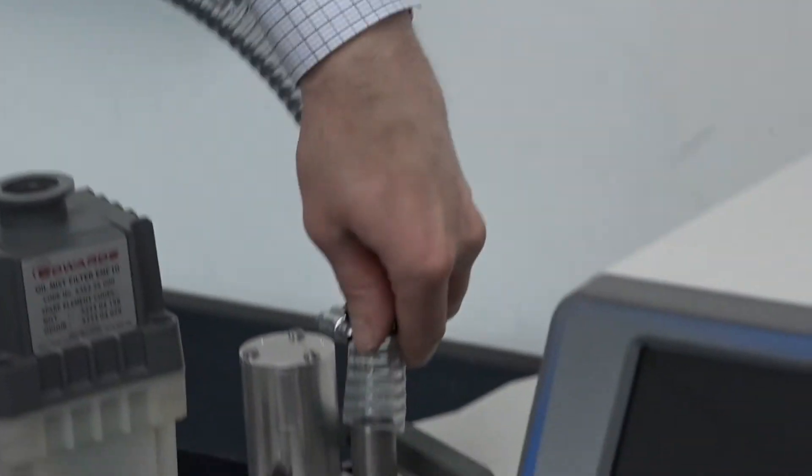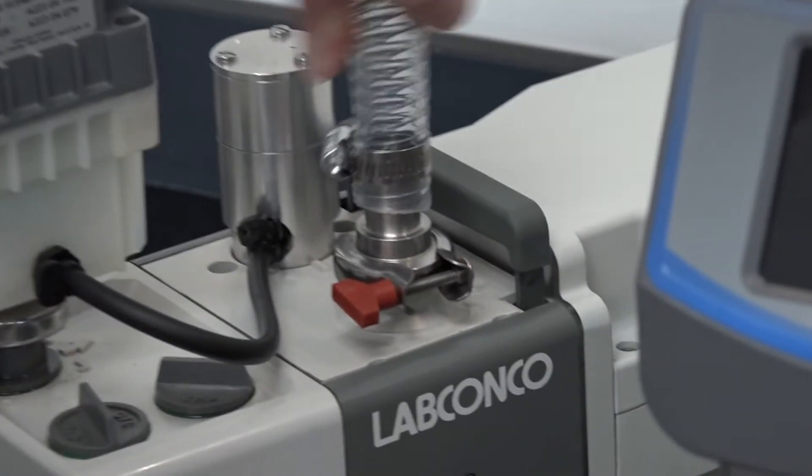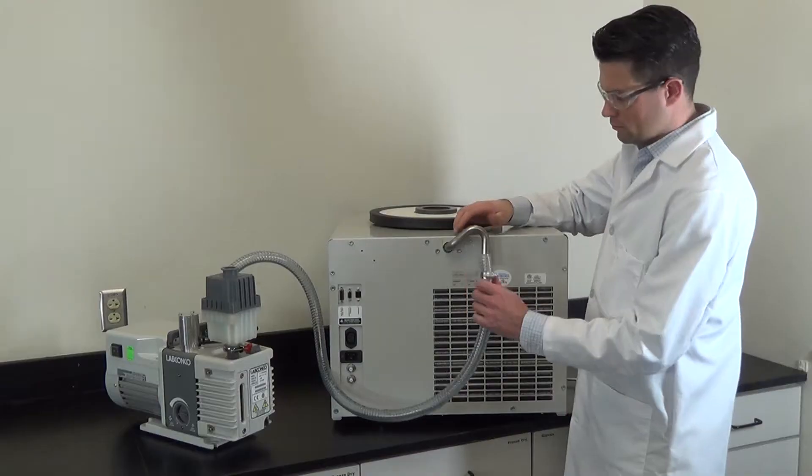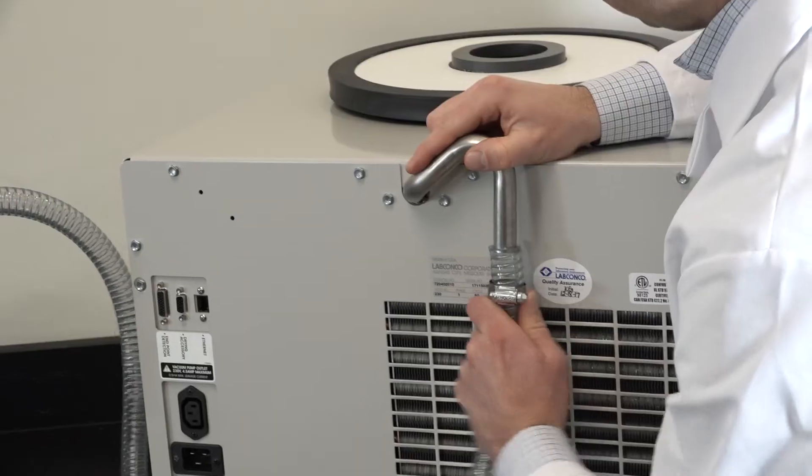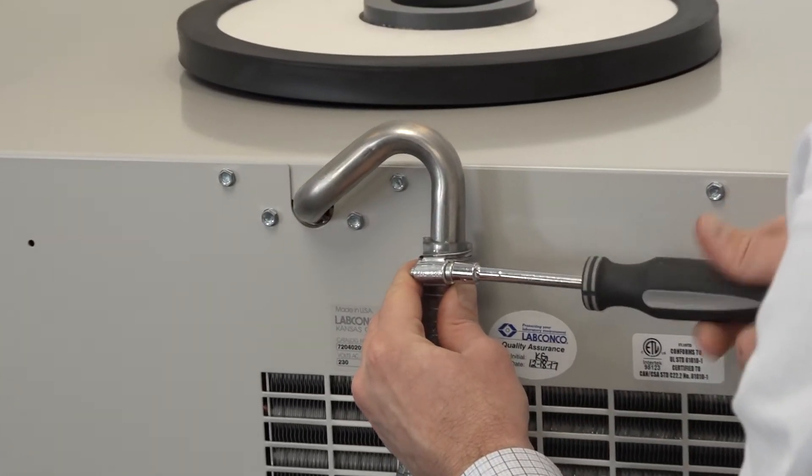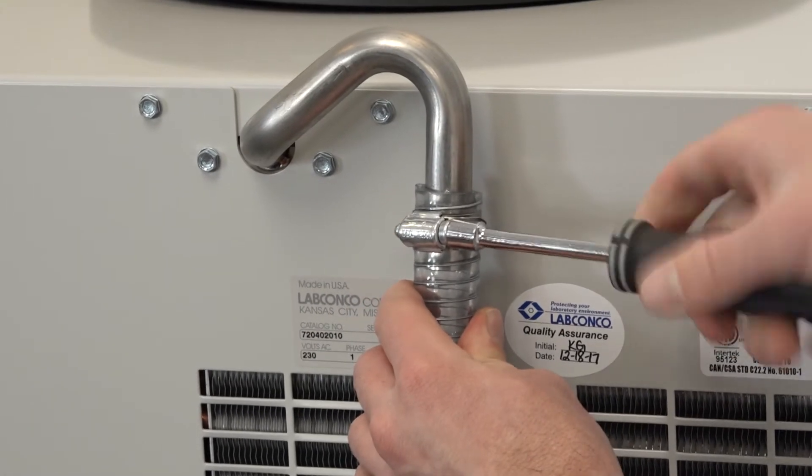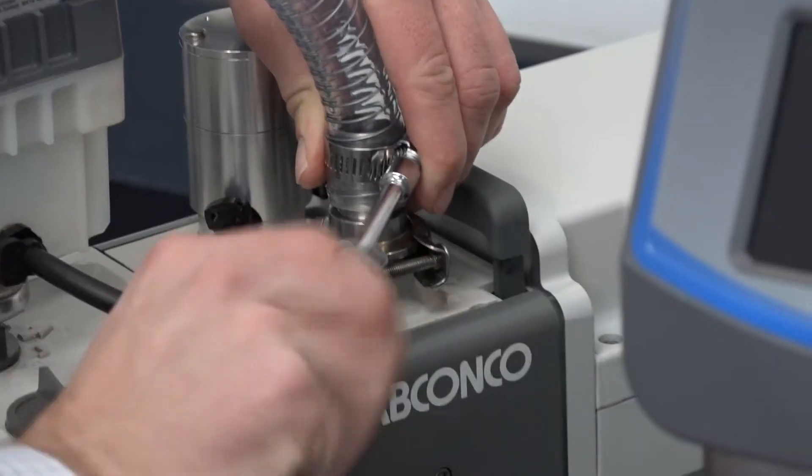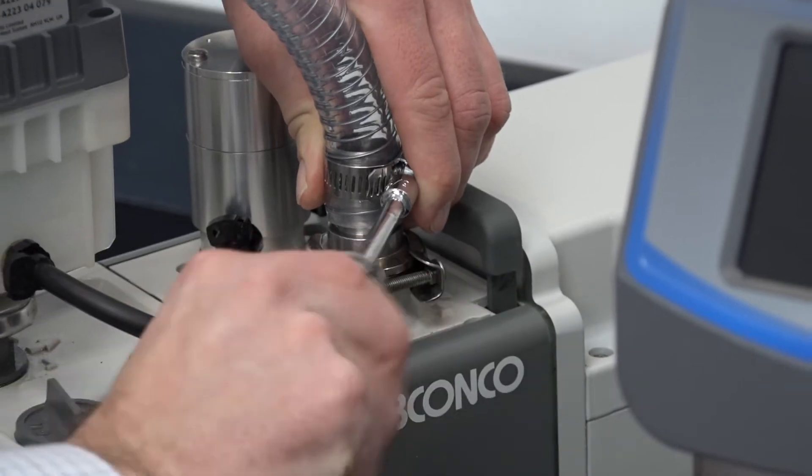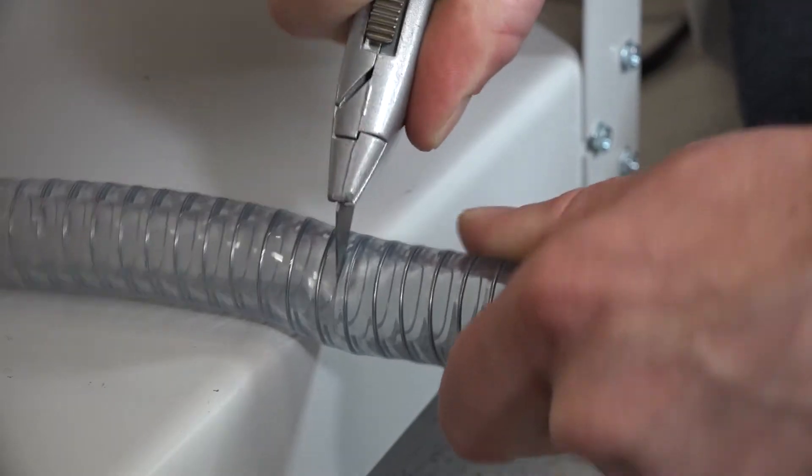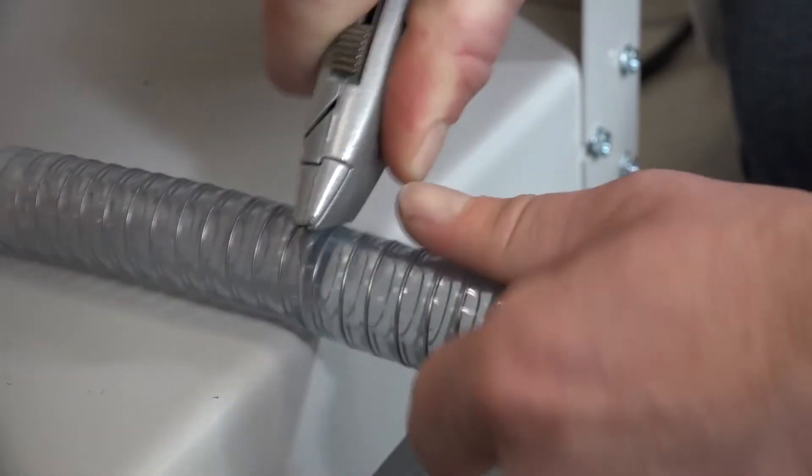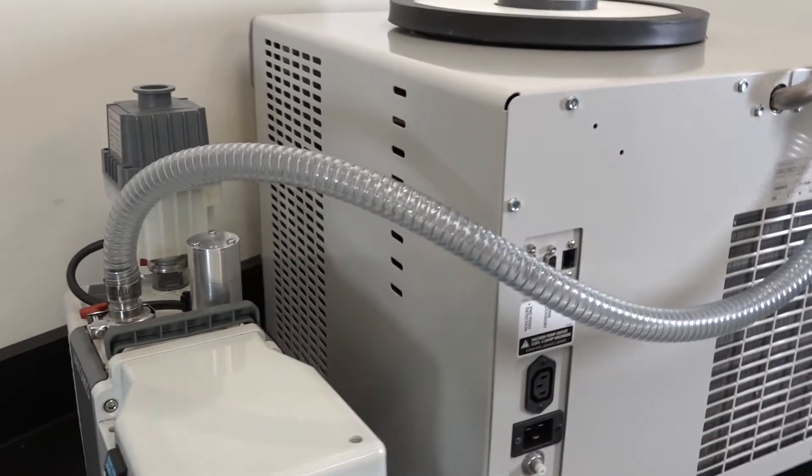Use a vacuum pump that can accept the ¾ inch ID vacuum hose provided. Use the hose clamps provided to attach one end of the vacuum hose to the outlet port of the Freezone. Tighten the hose clamps with a ¾ inch nut driver or a flathead screwdriver. Connect the other end of the hose to the inlet port of the vacuum pump. If necessary, cut the hose to allow for a gentle bend without kinks.